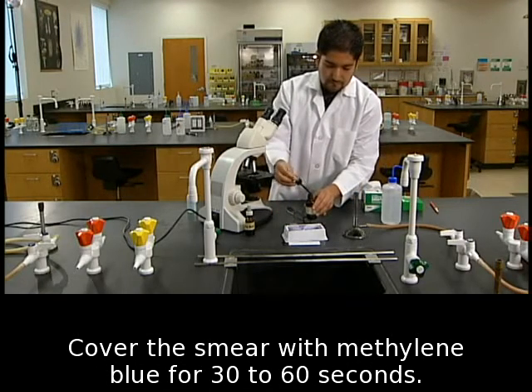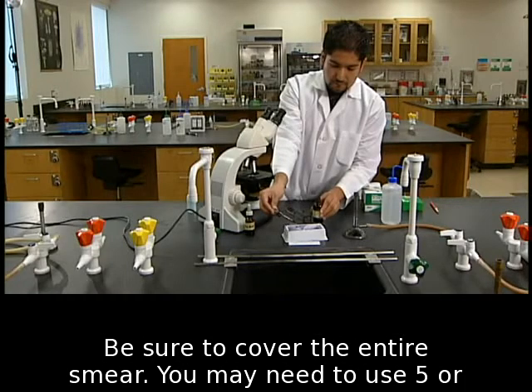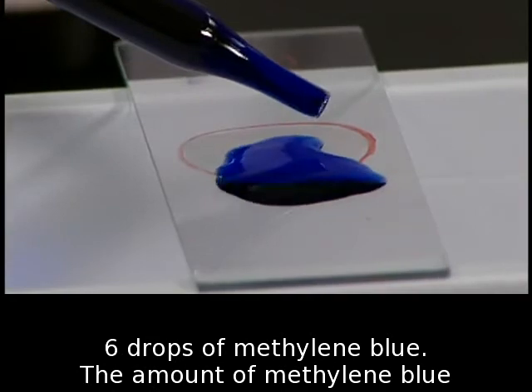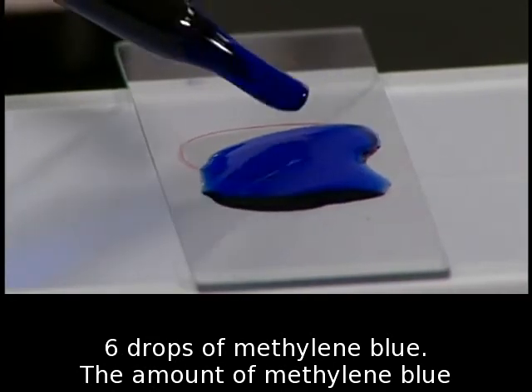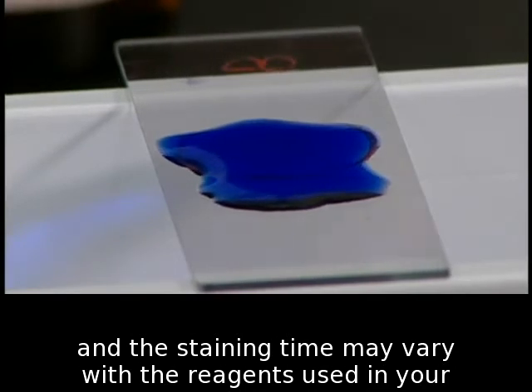Cover the smear with methylene blue for 30 to 60 seconds. Be sure to cover the entire smear. You may need to use five or six drops of methylene blue. The amount of methylene blue and the staining time may vary with the reagents used in your lab.